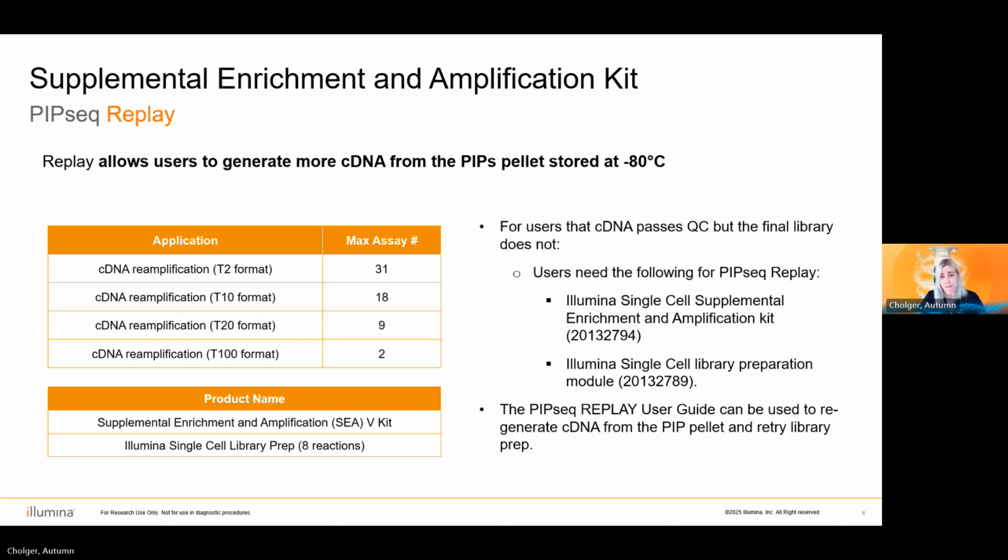But why would you want to do PipSeq replay? Well, most often in tech support, what we see is users that have their cDNA pass the QC in the user guide but don't have a final library that does, because something happened during library prep that failed. And so we want to get back to that cDNA that passed QC and try again.